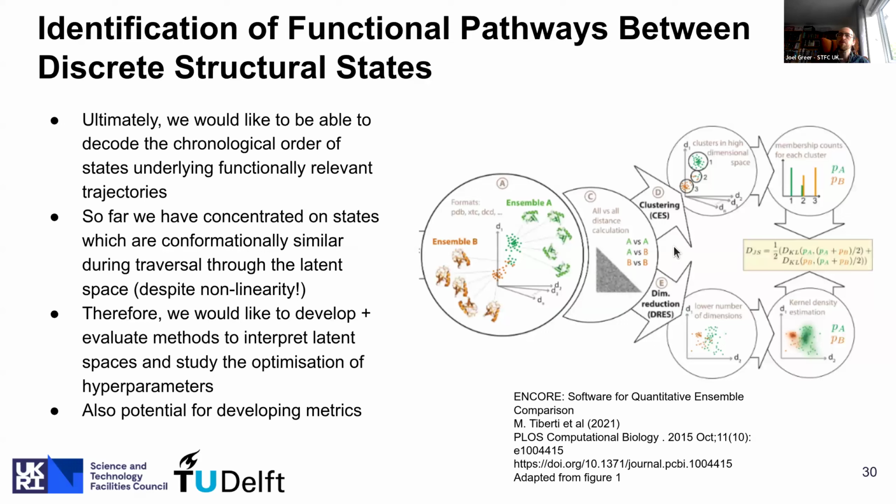they then compute a measure of similarity between each of the different states via this metric called the Jensen-Shannon divergence. We'd like to do this both for the MD simulations that we use to create our synthetic datasets, but also for the clusters that we derive using heterogeneous reconstruction algorithms, essentially looking at the clustering of the latent space, or potentially clustering of the volume space representations from these heterogeneous reconstruction algorithms.